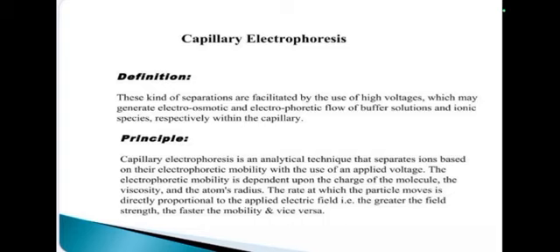First, the definition of capillary electrophoresis. This is similar to the gel electrophoresis technique. The capillary is filled with a polymer solution composed of either agarose or polyacrylamide that creates the molecular sieve. The molecular sieve so formed is known as a replaceable physical gel. The mixture of samples, when allowed to flow through the sieve, gets separated depending upon their mass to charge ratio.